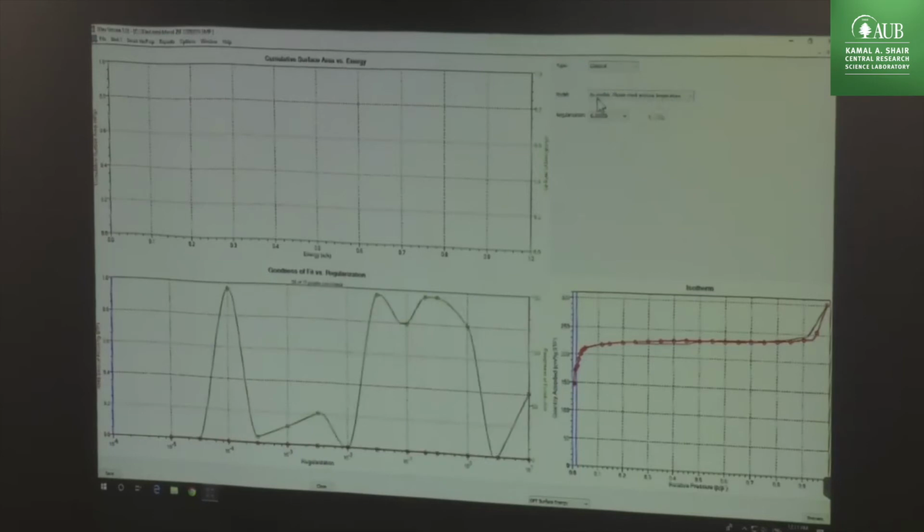Okay, there are no models, and because we don't have any models, it does not know how to calculate it. The first thing you have to do is download the models. It's very important. We have 7 different models. As I said, we have a guy who only works on this.